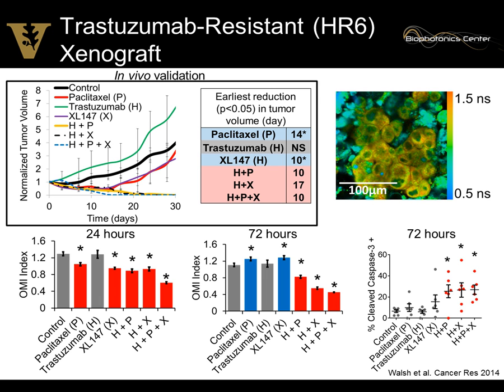This is a measure of apoptosis at day 3 from the culture. So we see increased apoptosis in these combination treatment groups, as you would expect based on the metabolic data.